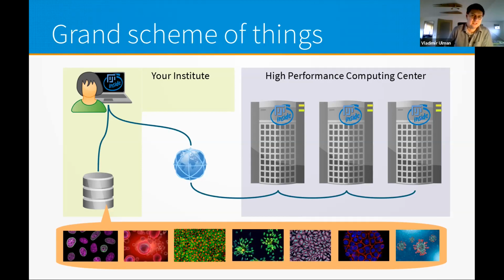We were expecting that it's not necessarily within your institute. If it is within your institute, then it's even better. But we are already facing a case where you are across the world, and this HPC center is in Ostrava, so we have to get to it. That basically means we have to establish a connection. So that's exactly the first step that we will be doing.